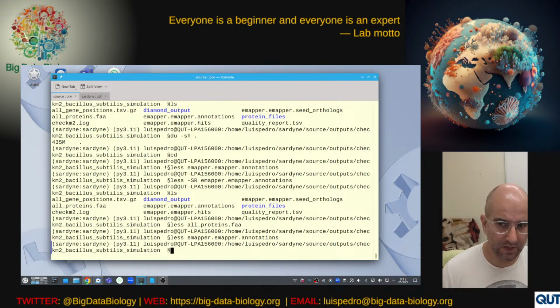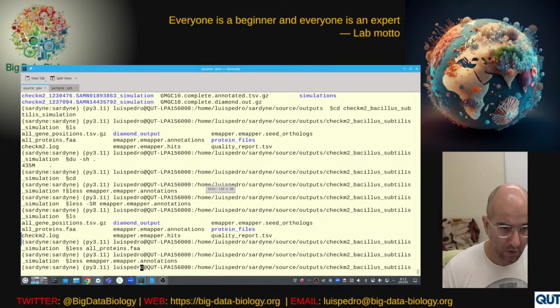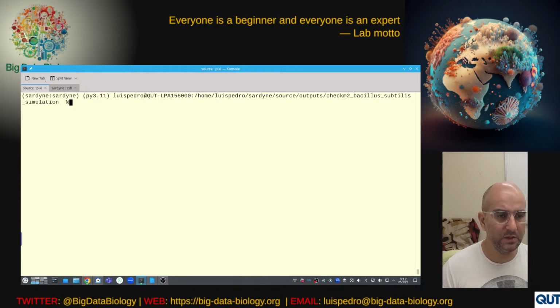The other thing I want to do, and actually that's where we'll start, is to interpret this, we need also some sort of background. And in the past, we've used the GMGC as the background. So we're going to do that again.